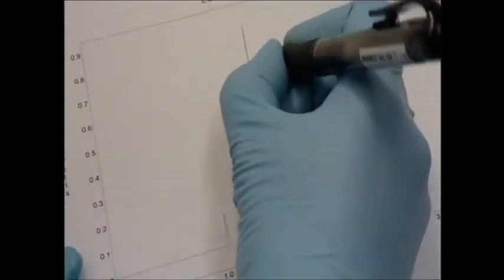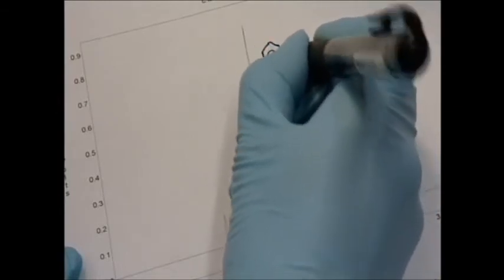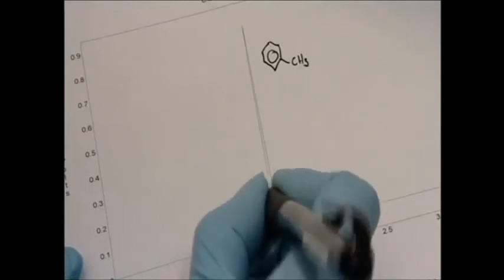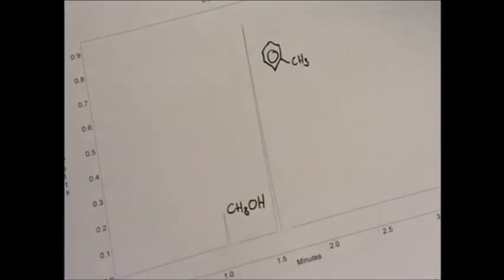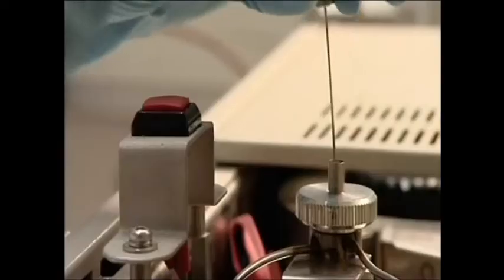The area under each peak is proportional to the amount of each component. The computer calculates this. This instrument is used for undergraduate practical sessions, and samples are run singly as and when each student is ready.